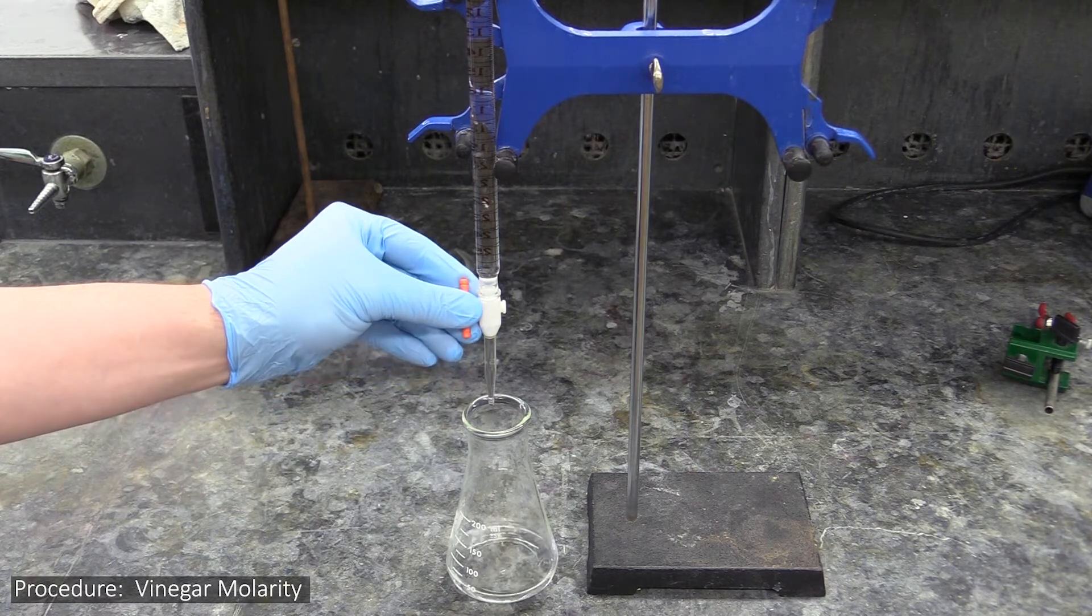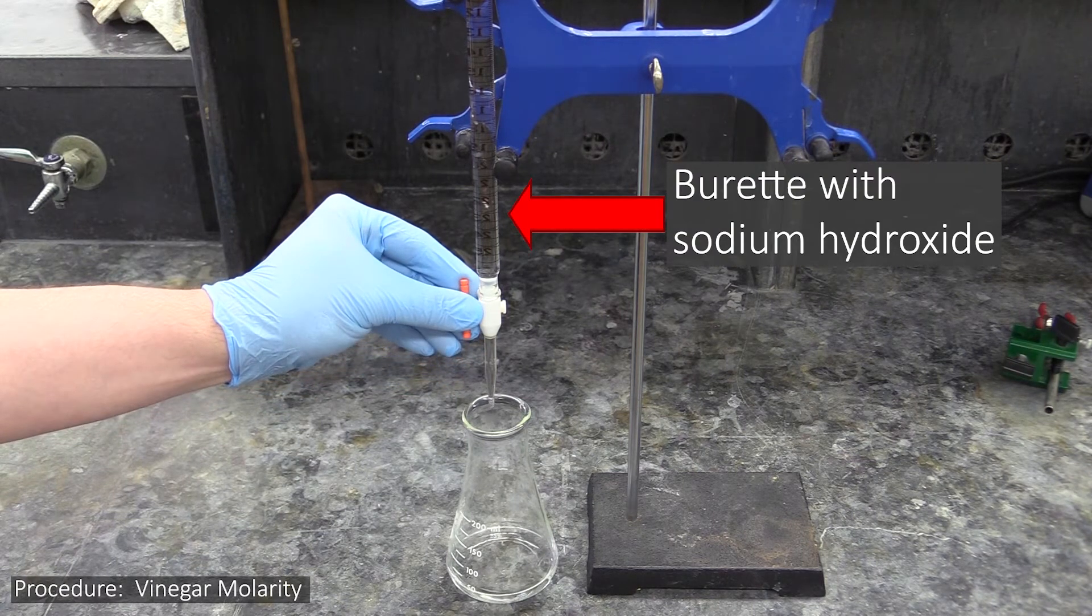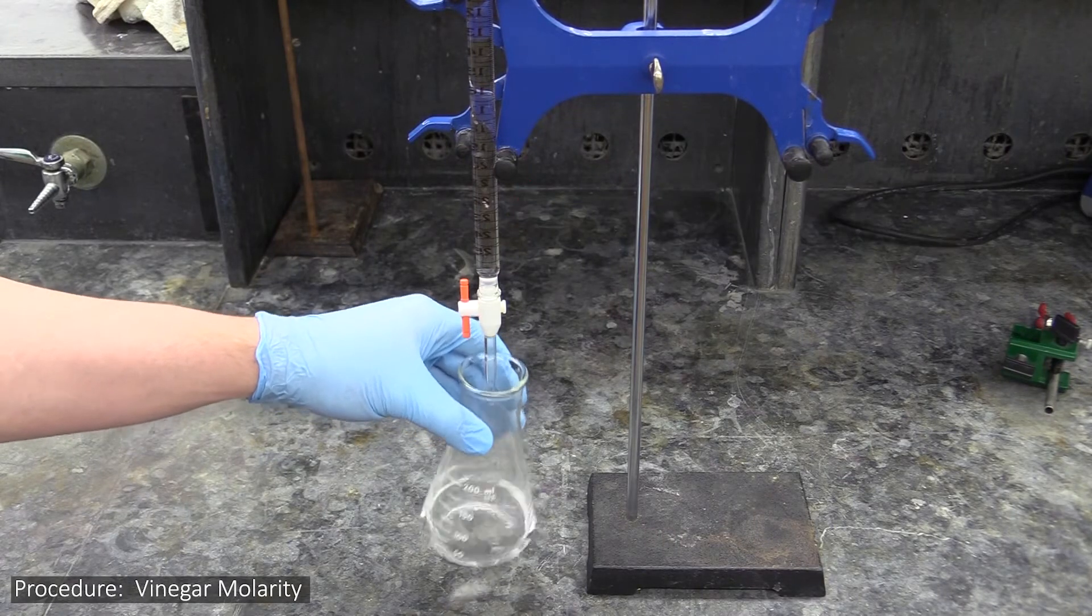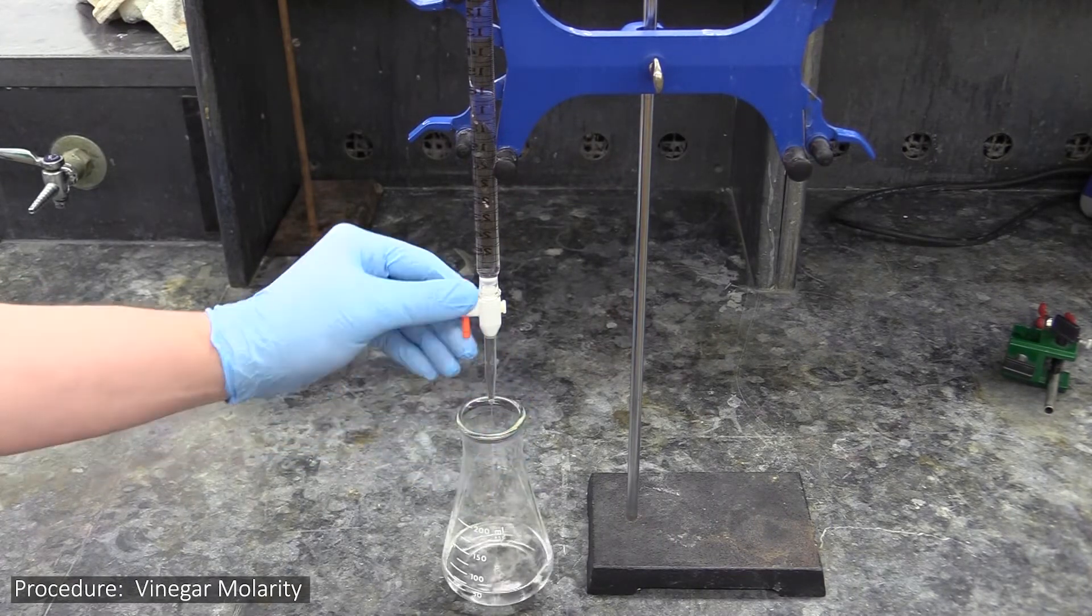For the titration itself, you'll use a burette to add sodium hydroxide to your flasks until the solution inside changes color. In case you're not familiar with using the burette, here's a few tips to help you out.